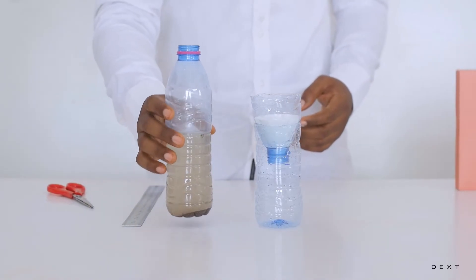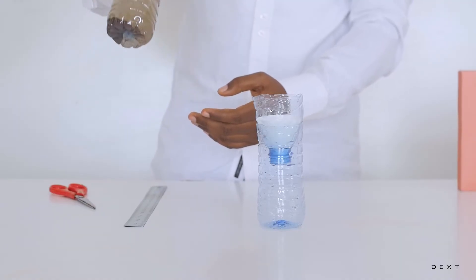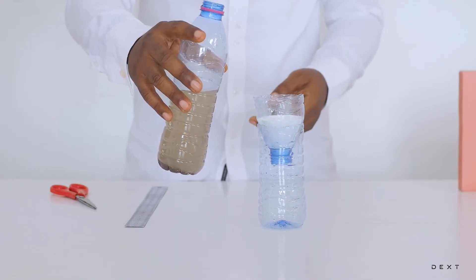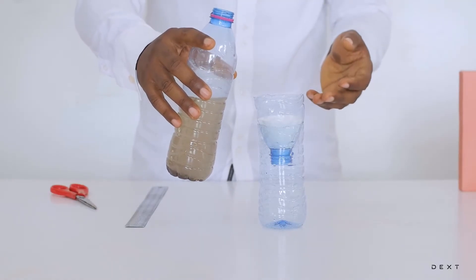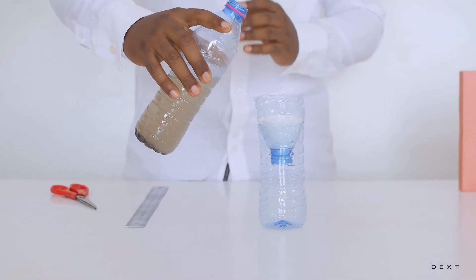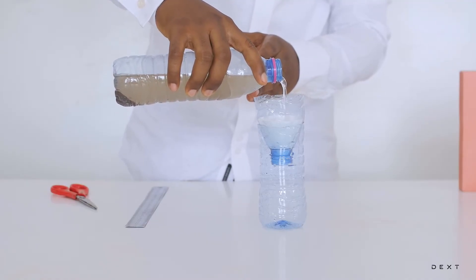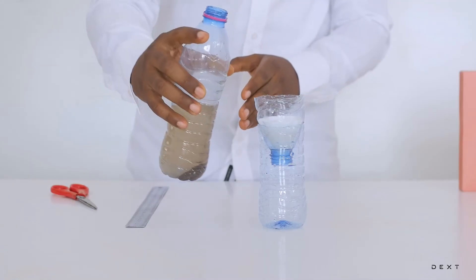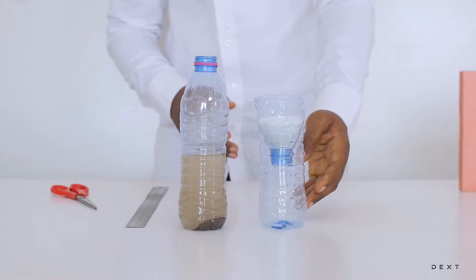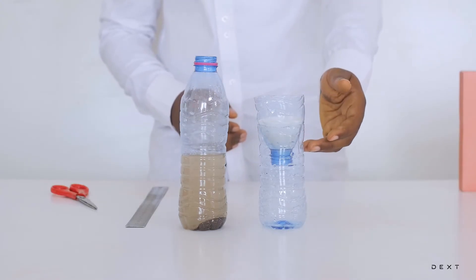Now bring in your dirty water, which we are going to filter using our setup here. You're going to shake it around a little to make sure it is indeed filthy with all the suspended particles, then pour it into the filter paper. Be very careful not to pour too much so the water goes over the filter paper — just gently aim and pour into the center, onto the cotton, and you should see the water slowly drip into the collecting bowl.